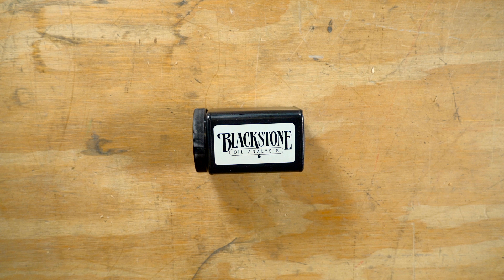So you have a sample to send. Now let's make some magic happen.